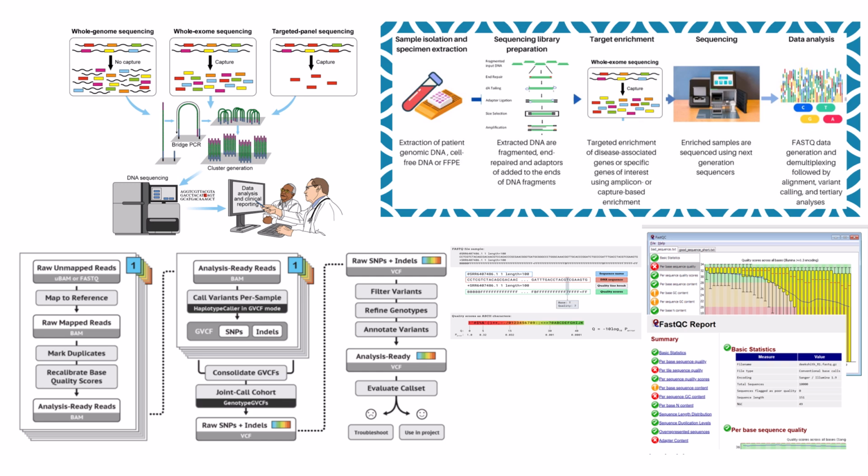Makes sense. You need to separate the signal, the real variance, from all that background noise. How do you start doing that? Well, first, there might be a normalization step, using tools like BCFtools norm. This just ensures that variants, especially complex ones like indels, are represented in a standard, consistent way. It makes comparisons easier later on. Okay, standardization. Then sometimes, for filtering purposes, variants are temporarily split into two groups, SNPs and indels. They often have slightly different error profiles, so applying filters might be done separately.